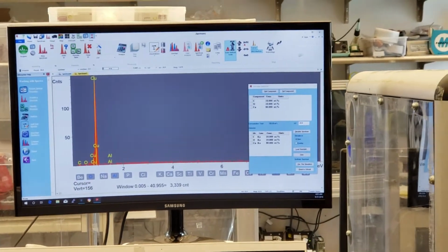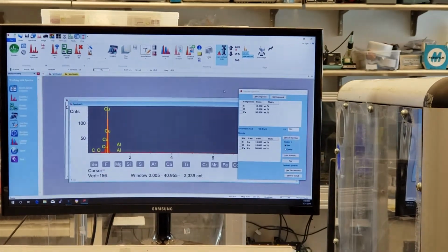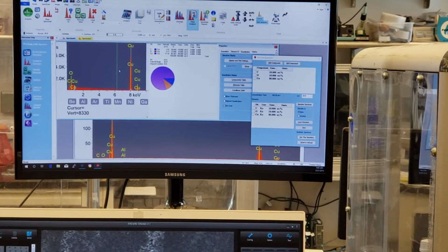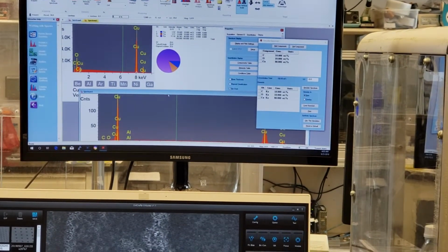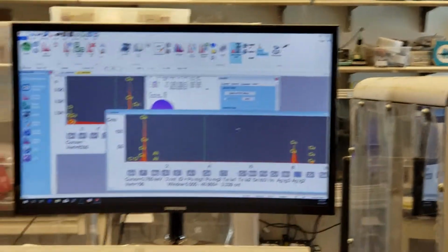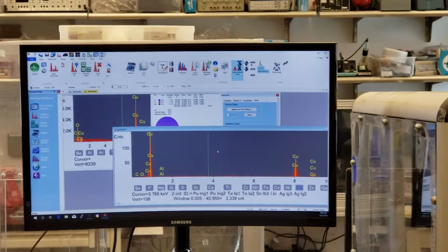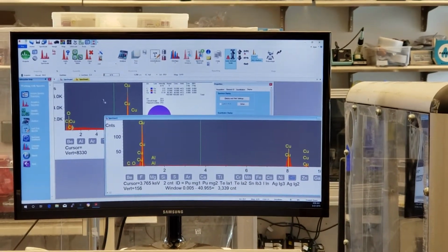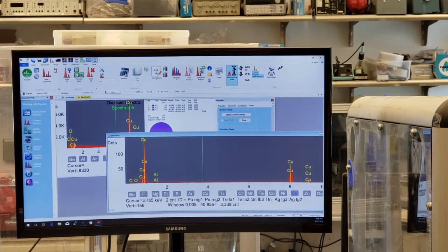Let's go stop. Let me shrink these two windows down just so we see two windows. So right now I've got two windows here, right? I've got a simulated spectra window and I've got the real window. So if I wanted to compare these two windows, I could just hold my control button down, control, left click my mouse, grab that spectra, see the little plus sign happened in there, drag it up over here, let it go, and I just overlaid it on top of this window.